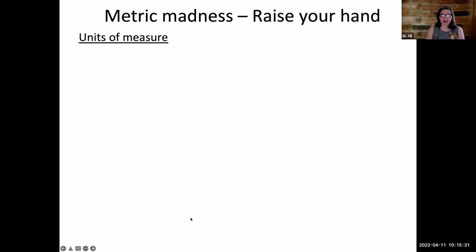Okay, the other challenge that I feel like people face is getting really comfortable with the units. Because micrometers and nanometers are smaller than we use in our daily lives, it can be a little bit hard to just have an intuitive number sense about them. And so we're just going to do some simple calculations just to kind of, again, warm up, get comfortable with them.